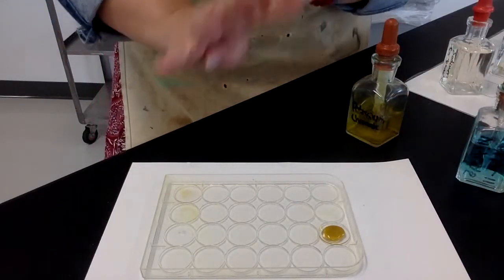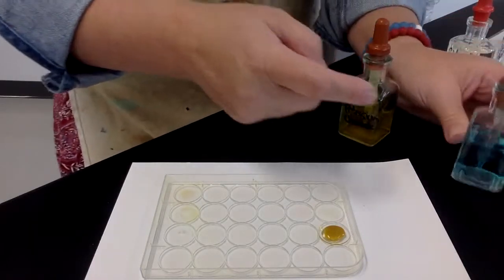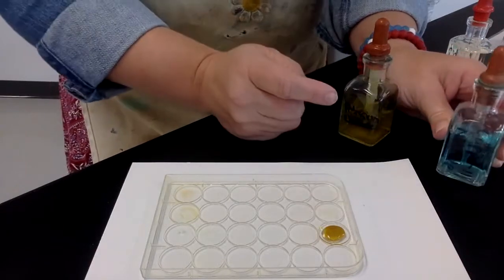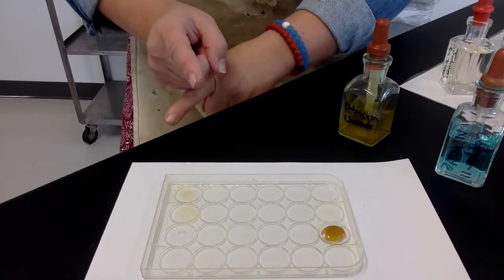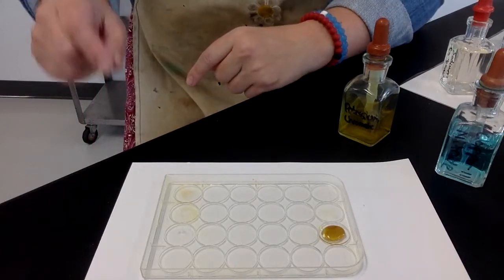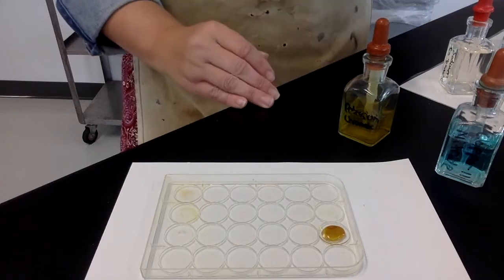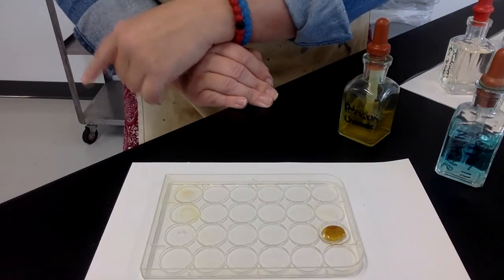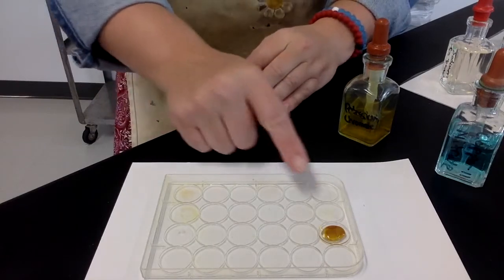You would write out their symbols and charges, put them together to write the formula for potassium chromate and the formula for copper 2 nitrate. You see the precipitate. When they switch partners, the one that is NO3 is soluble. It doesn't form a precipitate. The one that is not with NO3 is insoluble. That is your precipitate. Okay? So there you can see it.